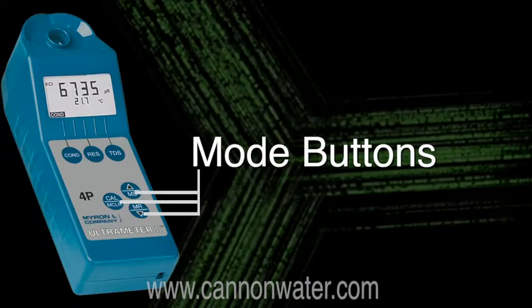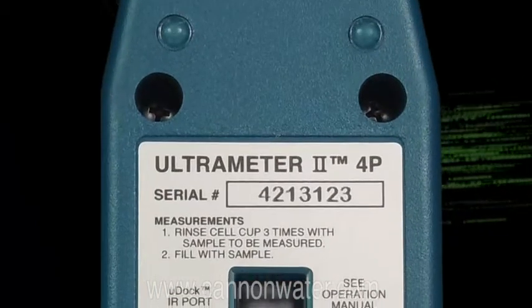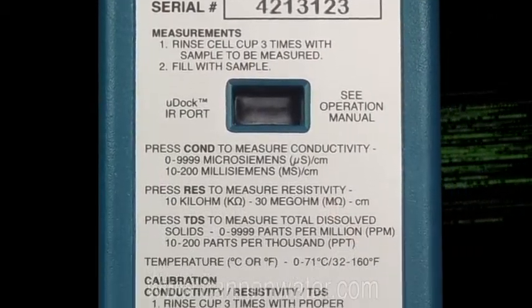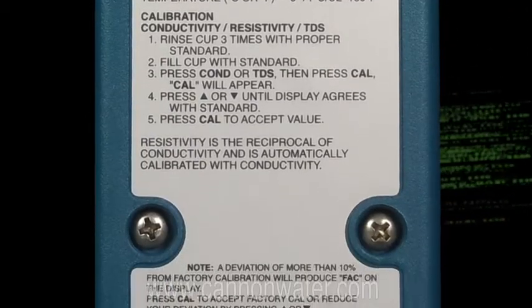Everything gets done from the top panel and is easy to use. On the back of the meter you have a simplified instruction guide, so if you don't have your manual with you, you can flip the meter over and refer to the instructions on the back side of the instrument.